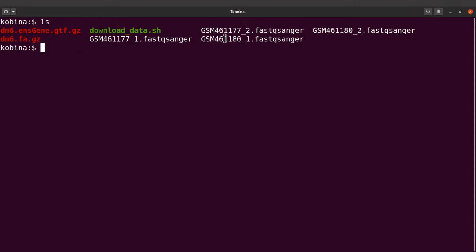Now we are going to place the fastq files in another directory. So let's create a directory. We will say mkdir data. And then we are going to say mkdir data/fastq. I'm doing this just so that I can group my files. It also makes my work more organized, and it's easy to locate files if you have naming conventions, and if you also have folders that you can put them in.